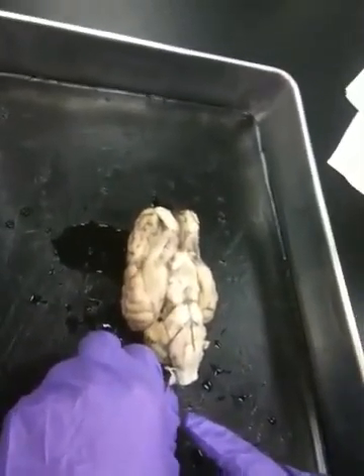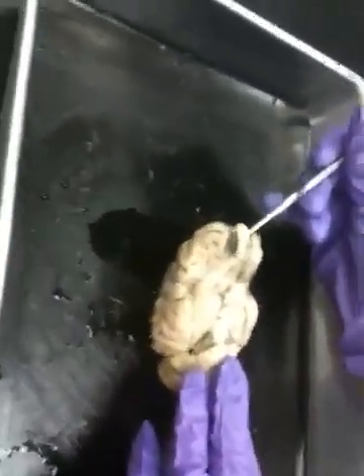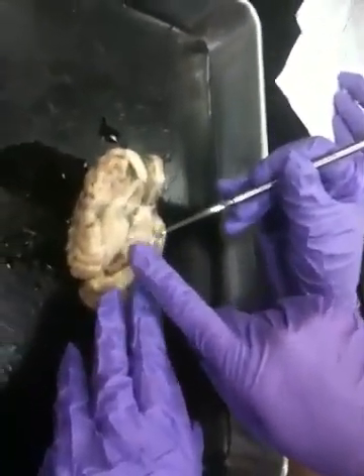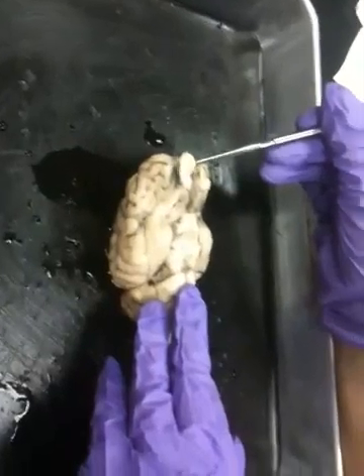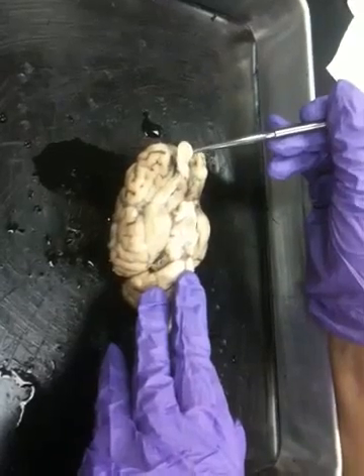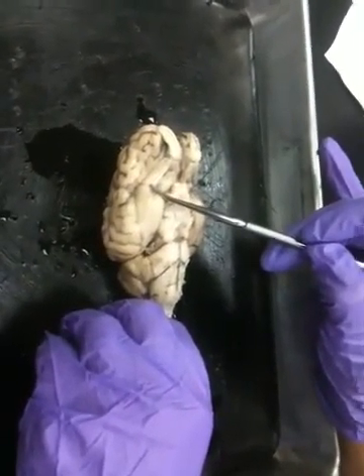Olfactory tracts. Okay, good. So these huge floppy things here, these are their olfactory bulbs, right? Because they're animals. These are the cerebral peduncles, but we just have to know it as midbrain on the sheet. So here is theirs. It should be big. There should be two of them. Sometimes they get kind of choppy as they try to dissect them. You can see these that look like horizontal bands. That's what a tract actually looks like on the brain.